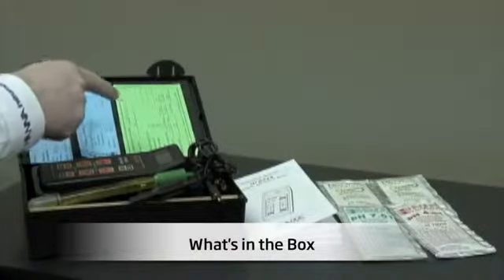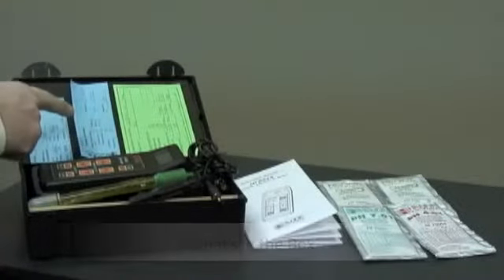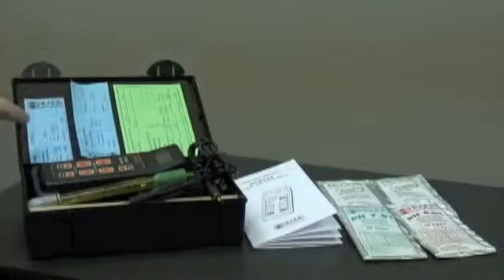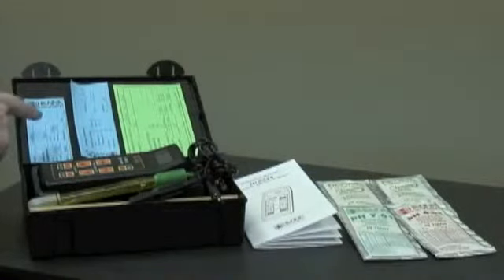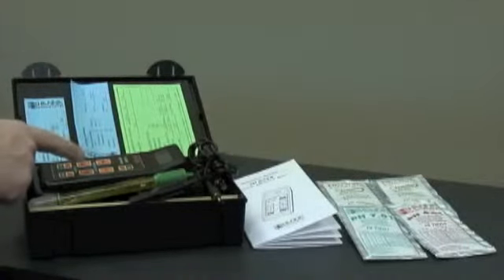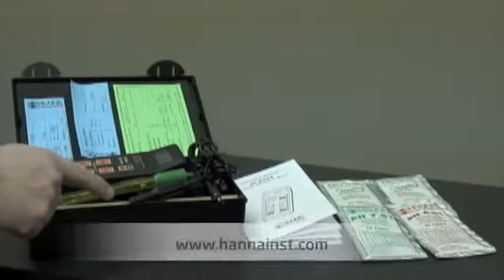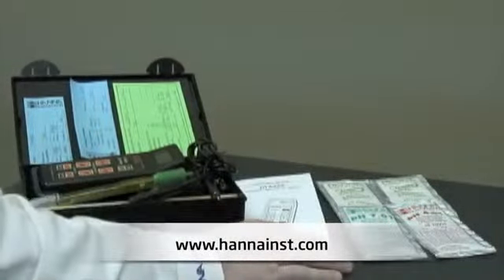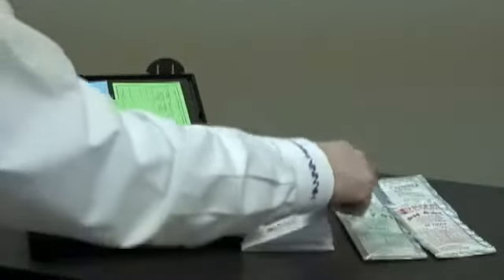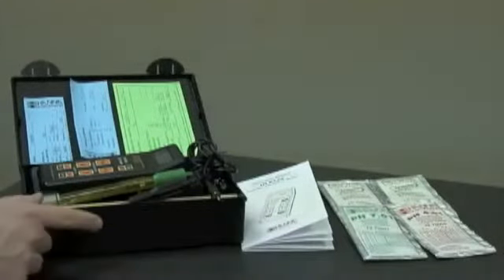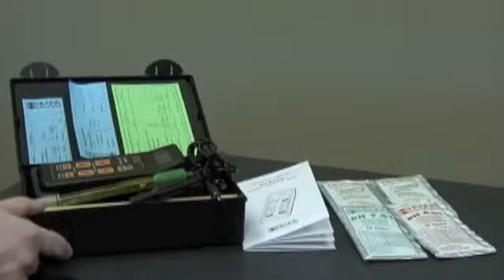Now I'd like to show you what comes in the box when you receive your unit. You'll receive a calibration certificate for the meter, a testing certificate for the pH probe, a testing certificate for the temperature probe, the HI8424 pH meter, a pH probe, a temperature probe, instruction manual, buffers, calibration solution, all contained in this rugged plastic carrying case.